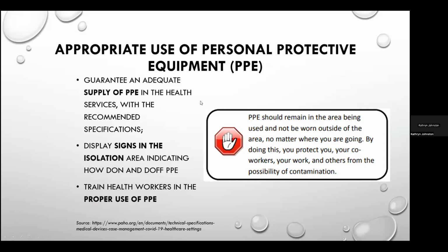So I talked a little bit about the appropriate use, but some things that are important to keep in mind is that PPEs only work if the healthcare workers have access to them. So you have to have an adequate supply of PPEs available, and you have to make sure that the healthcare workers are trained in the appropriate donning and doffing and use of those PPEs. The use of visual reminders as part of a multimodal strategy helps to reinforce the training that healthcare workers receive in selecting and donning and doffing their PPEs. So it's good to have visuals around.